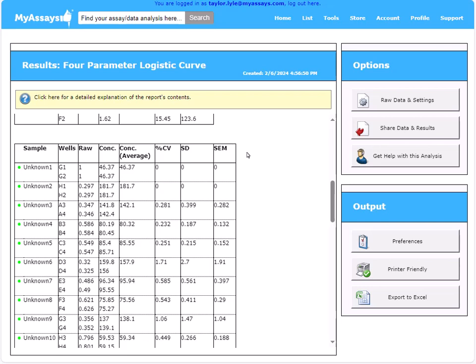These results can be exported to a printer-friendly version, exported to Excel, or you can share the data and results with a colleague by selecting the share data and results option to create a unique link.